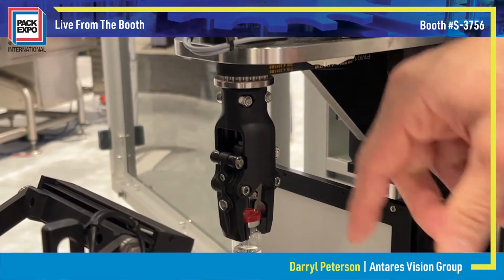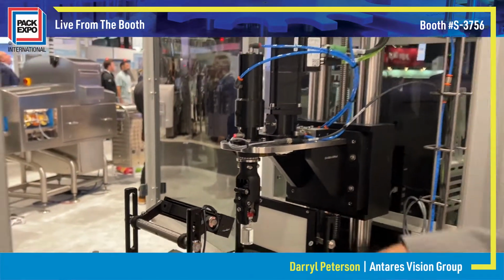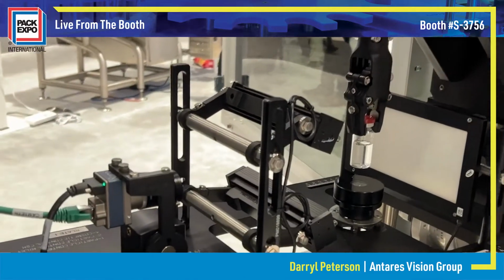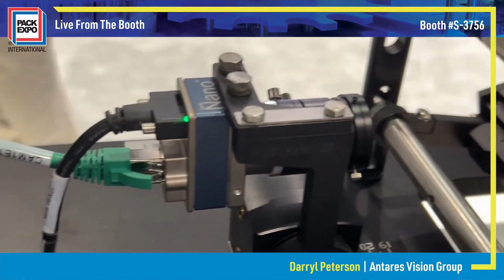Why do we spin that? If there are particles inside there, we're going to be able to move those particles. And the camera that you see over here will be taking images after we stop the vial from spinning, so that we can actually catch those particles in motion.